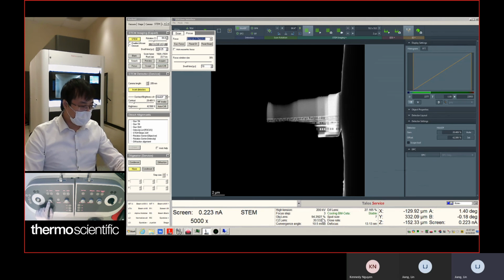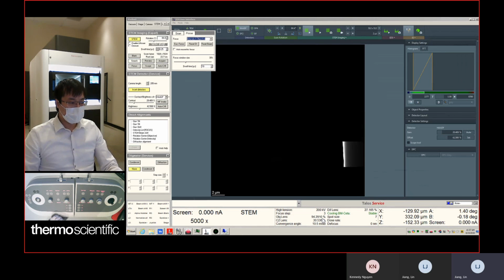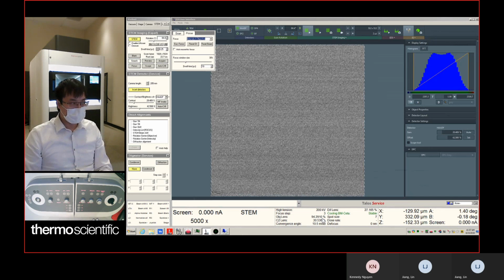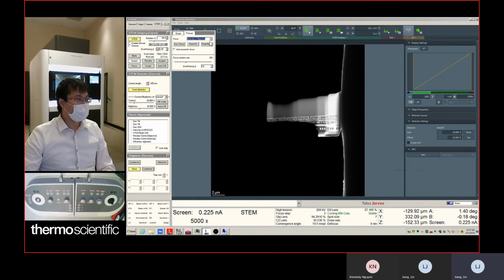When we use the intensity knob, my left hand, it changes the C2 value. When you change that, you can always go back; say you change your focus, it's going to go back to 0. On a sample, I usually choose intensity.